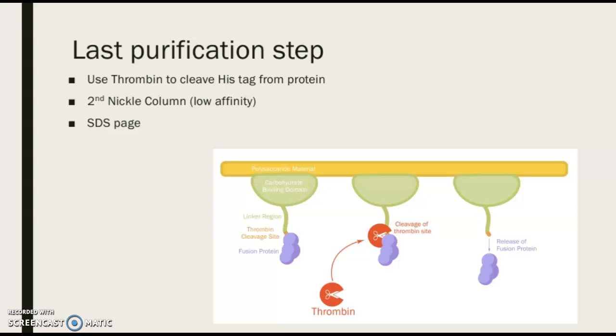I would also like to mention that I typically will use only one or two SDS-PAGEs throughout this process, just so I can have a better view on one gel. I will go over this in the next slide, but when you use multiple lanes, you can identify how pure your protein is, and you can compare them easily when they're all on one gel.